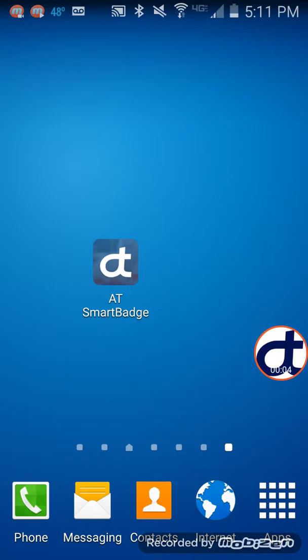I want to take a few minutes to review our new AT SmartBadge app. We developed this app as a perk to our badge customers to help them record their sampling information during monitoring events on their mobile devices and generate lab request forms automatically.